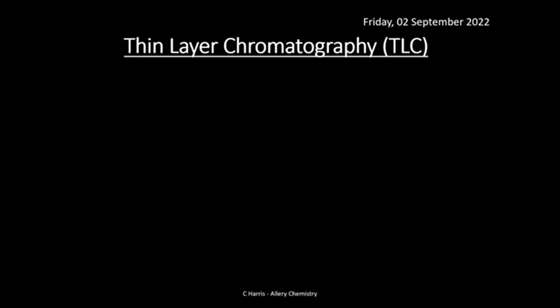So this topic really looks into a few different techniques, and we combine all of the techniques from year 1 and year 2. So, analytical techniques used to identify compounds in chemistry. First of all, I want to start with thin layer chromatography, or TLC.